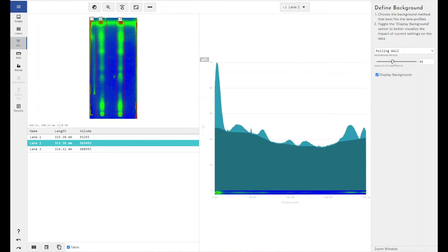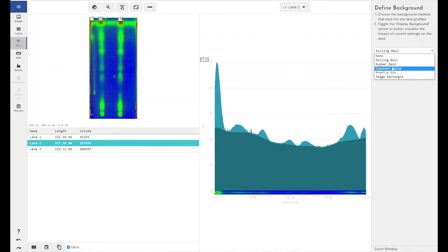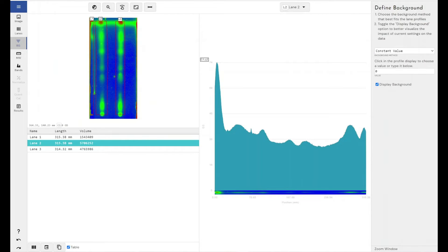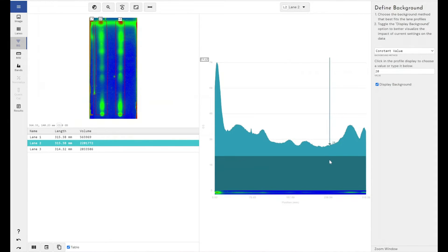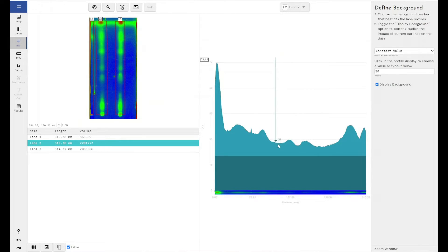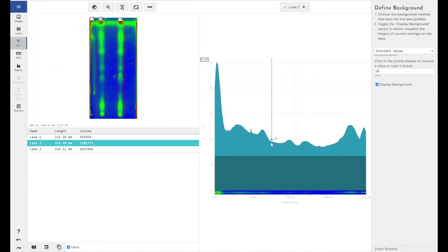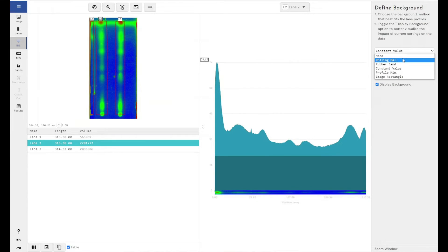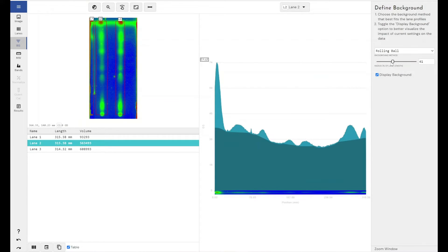What it does is it recalculates the background as you move along the lane. It changes the background relative to the background at that point in the lane. Whereas if we just use something like a constant value, say 20, it doesn't take into account areas of the lane. So for example, here, this is background. There's no signal here. However, this section of background for our experiment is lower than this area of background here. So if I used a constant value to remove this, I would still be counting this towards my measurements.